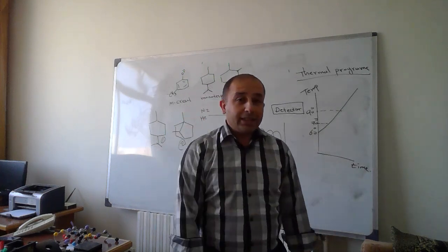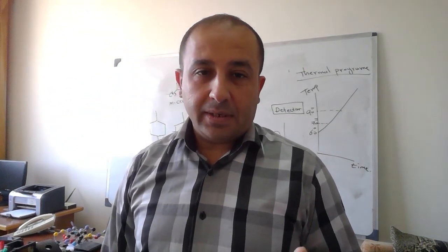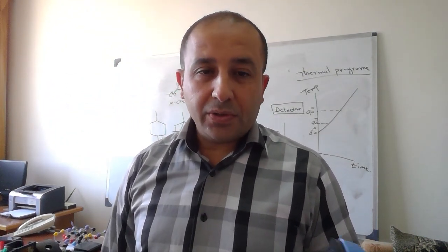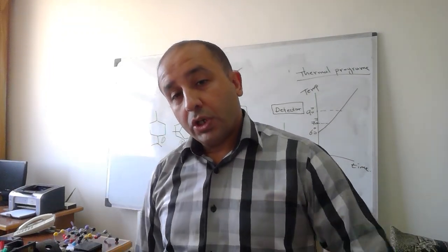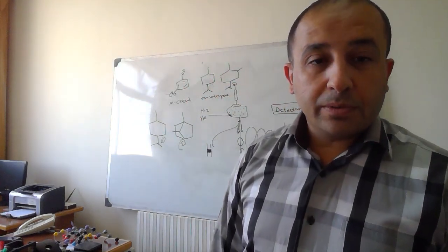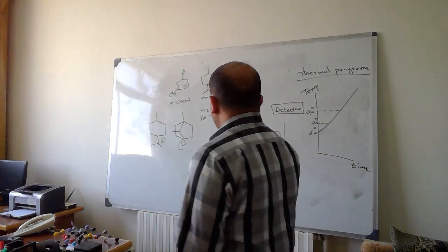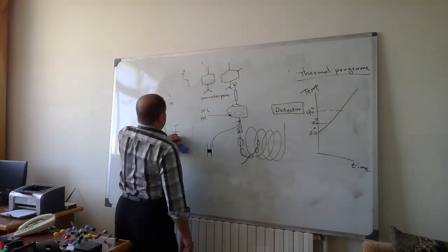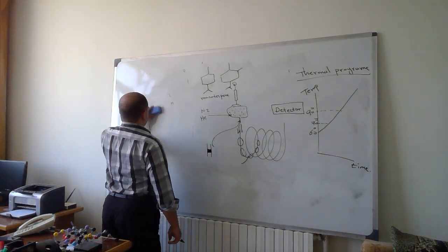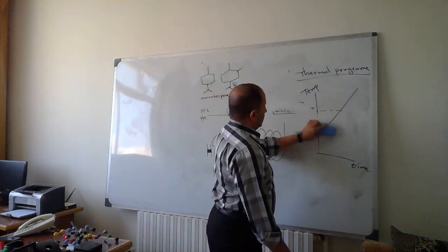Now, we need to have detectors for gaseous material. Okay, so we cannot use, for example, UV, fluorescence and other detectors which are usually hyphenated or used with chromatographic techniques. So they thought of a suitable detector.